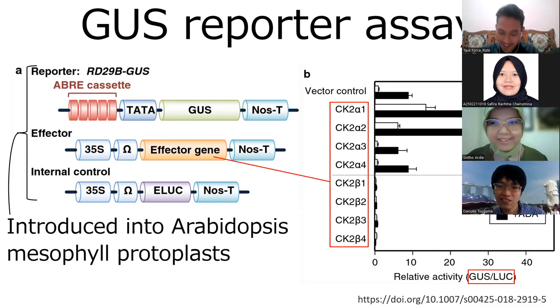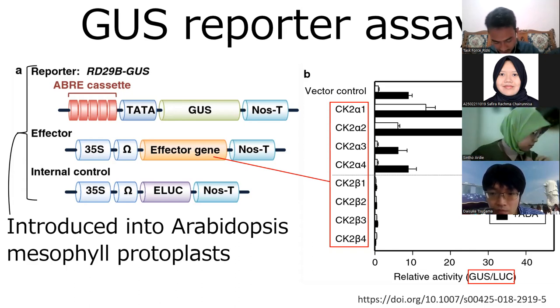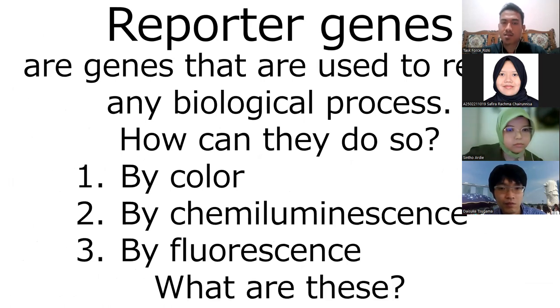Thank you so much. Your third question, if you have. Probably a simple question, about the duration of the reporter genes that you said before. I don't get the most important thing about that, like using something like a fluorescence timer. So how do we use that method for general purposes or specific purposes? What is the most benefit of lengthening the fluorescence or the reporter gene activity duration?